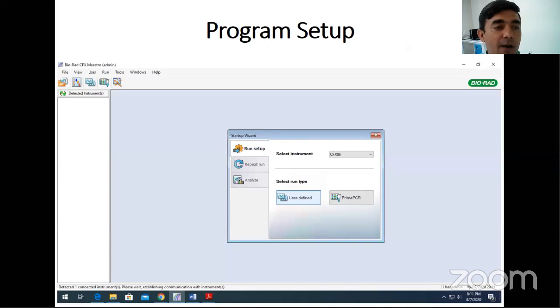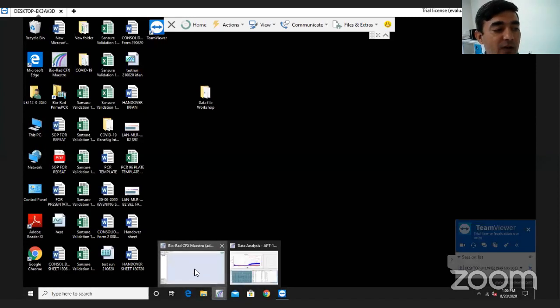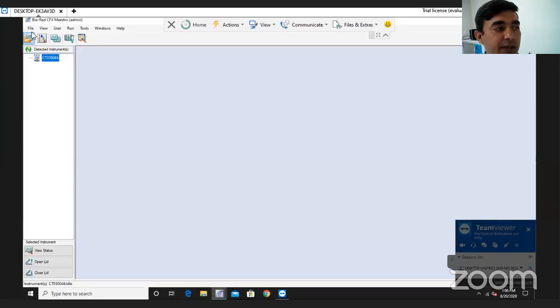Here we perform a PCR setup, how we perform the PCR setup at this time. Right now we are performing one of the experiments, and I will be showing you this experiment here. This is the software which we launch over here.